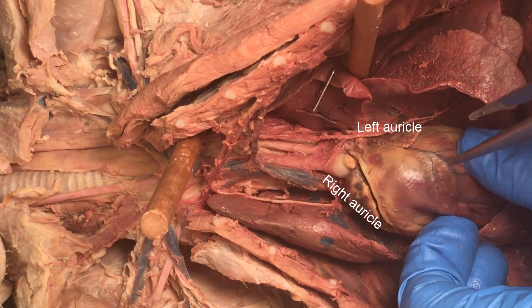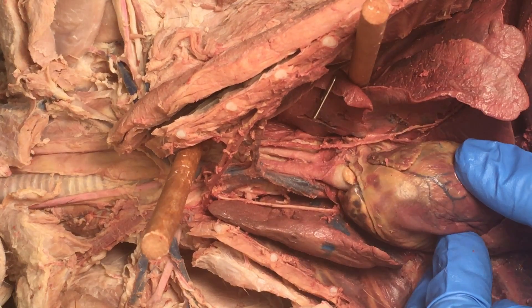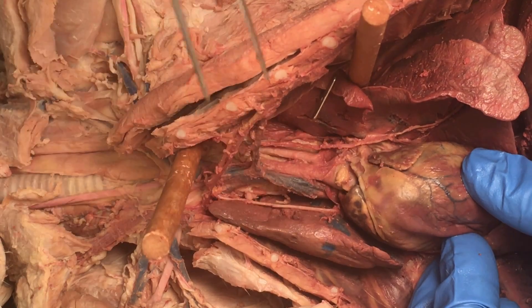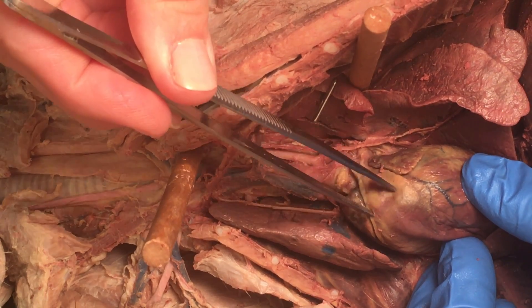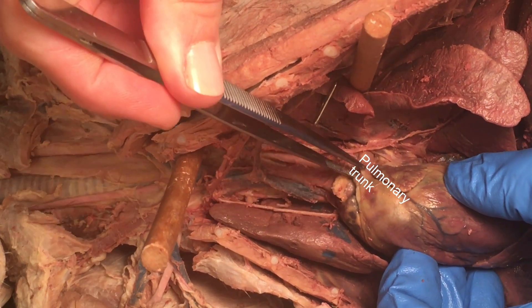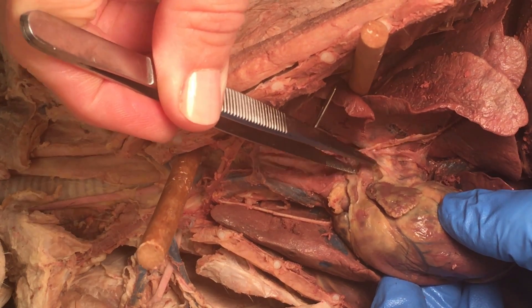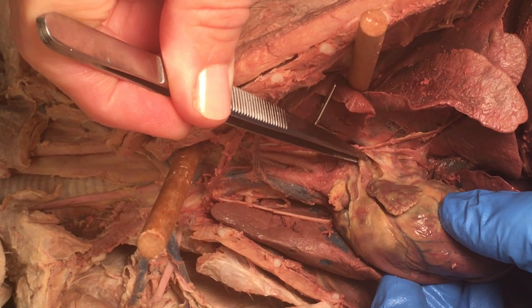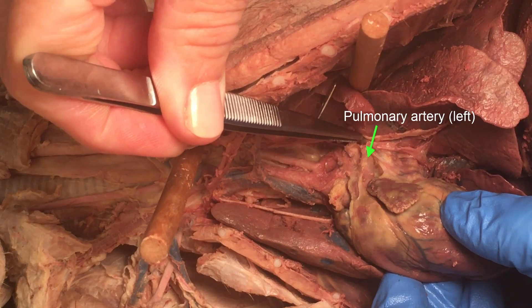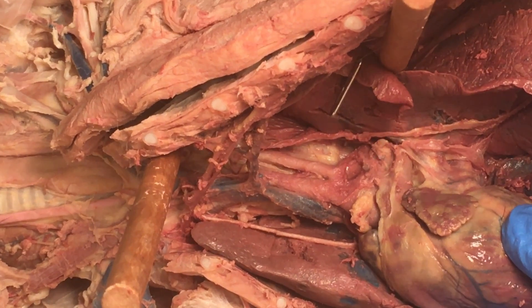You can see this structure — it kind of narrows coming up to the top of the heart, and this is the pulmonary trunk. The pulmonary trunk narrows and narrows, and then you can see this structure here — that's a pulmonary artery. It's heading right into the lung there.